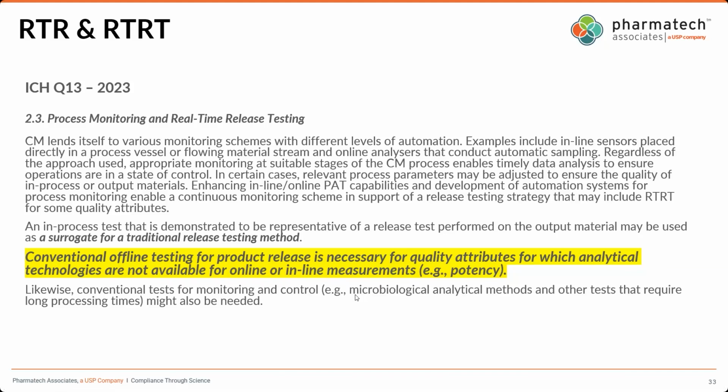We are not going to overload the actual manufacturing system control, because you have to have automation for sampling and the sampling frequency. So the less complexity you add by integrating more testing, the more reliable and more strategic a way to use PAT in a commercial setting. I see more and more cases where the industry is going towards developing predictive models and soft sensors and applying them in the commercial manufacturing setting.